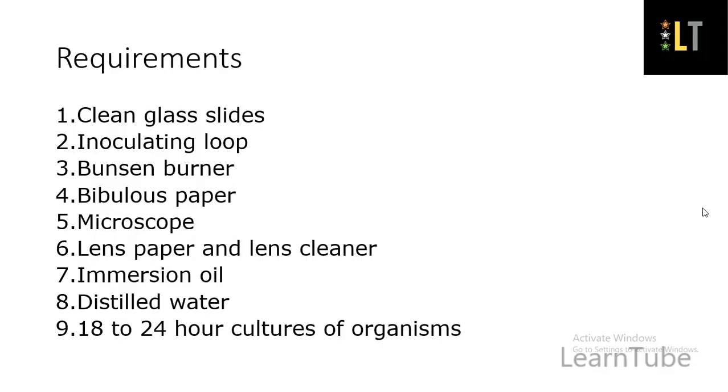So following are the requirements for acid-fast staining technique. First is your clean glass slides. Then inoculating loop, which is also called a microbial loop. Bunsen burner in order to sterilize the inoculating loop. Bibulous paper, that is the same as tissue paper or filter paper. Microscope. Lens paper and lens cleaner in order to clean your objective and eyepiece.